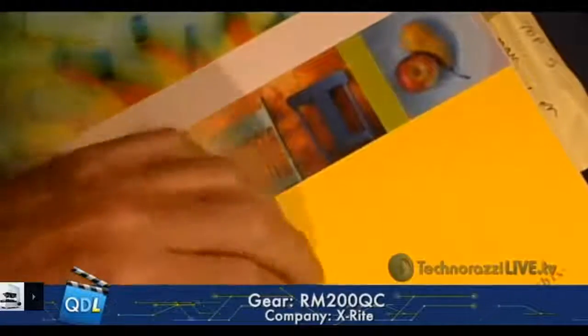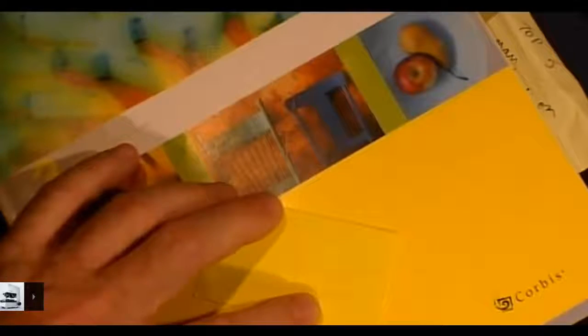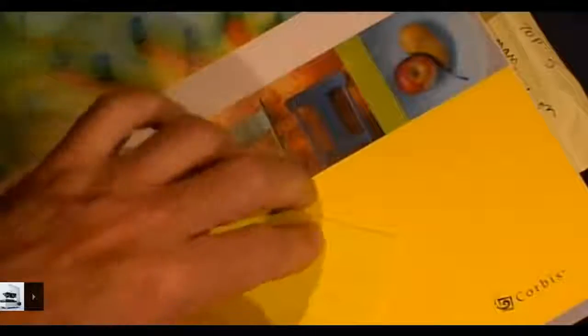I happen to have a very close yellow. In fact, let me show you. I happen to have a book here. On your screen, these yellows probably appear to be fairly close, and they are in fact fairly close. My standard is a bit lighter yellow than the color on this book, but we'll just measure the one in this book just the same.